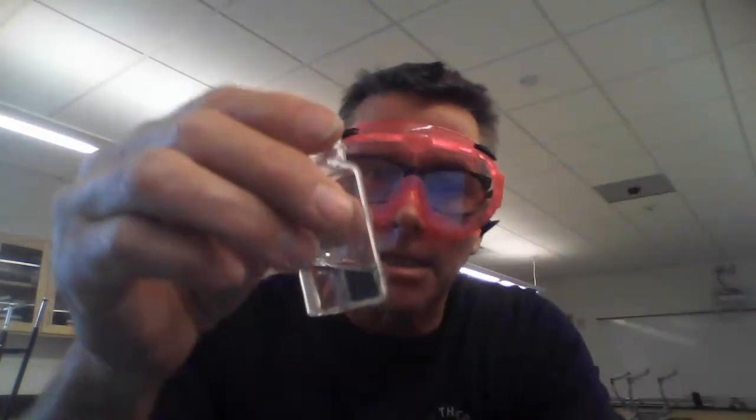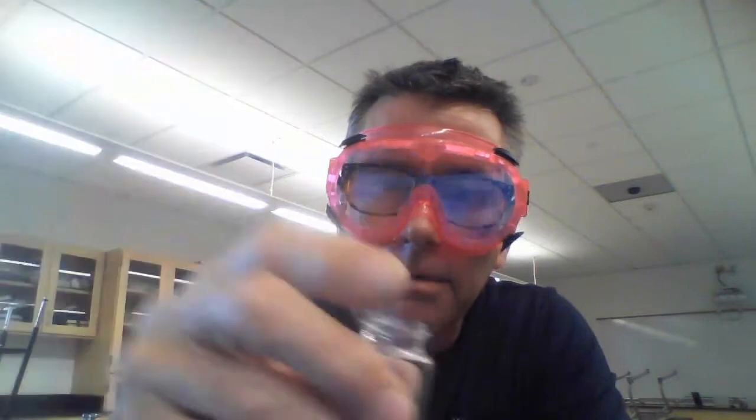Okay, first I'm just going to take a look at each of the known samples and describe what they look like and smell like. So no number, but we'll call it water because that's what it is. Clear, colorless liquid, no odor. Methanol. Clear, colorless liquid. These are all going to be clear, colorless liquids, so I'll just cut to the chase. I really don't smell anything.